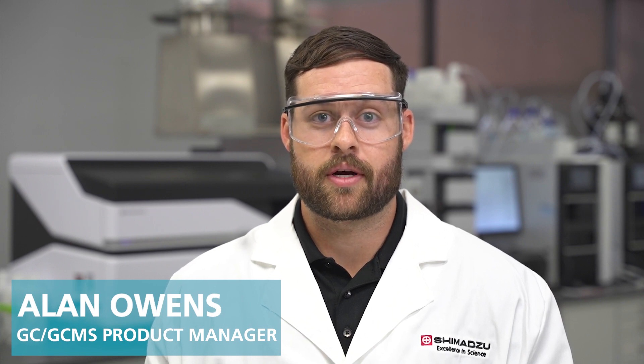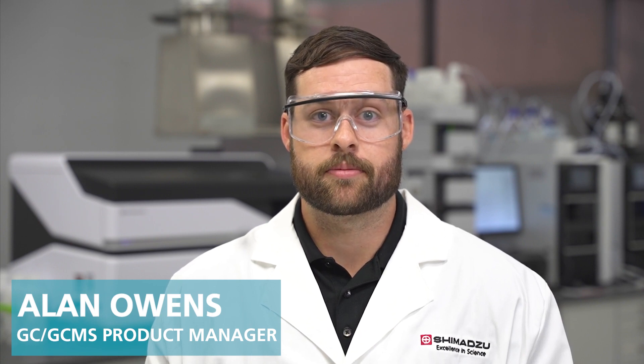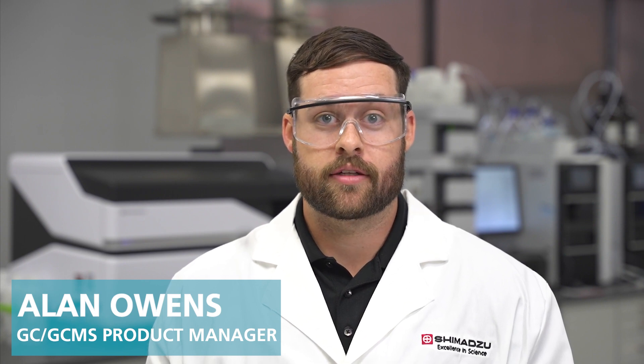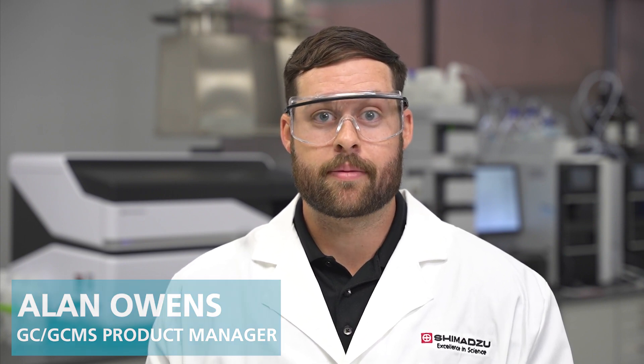Hello, my name is Alan Owens, and I'm the GC and GC-MS product manager here at Shimadzu Scientific Instruments. In this video, I will show you how to extract the hardware configuration from a LabSolutions data file.